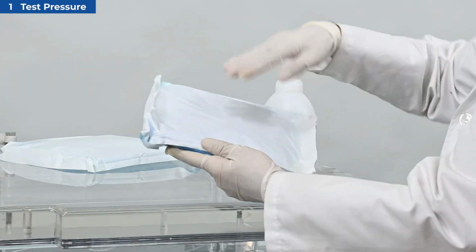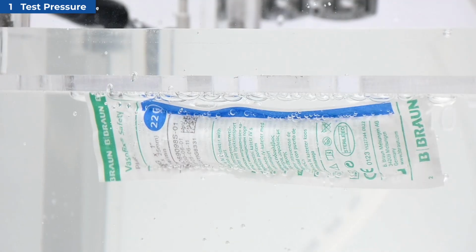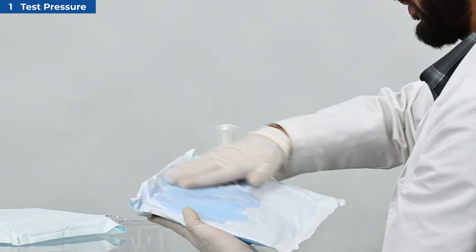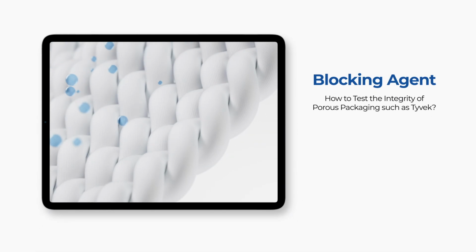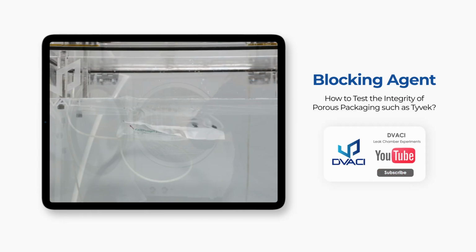In porous packages, such as those made with Tyvek, the natural breathability of the material may generate bubbles that do not correspond to a leak. ASTM F2096 acknowledges this phenomenon and recommends the use of a blocking agent. We have a dedicated video showing how to apply it correctly. If you work with Tyvek or medical paper, we strongly recommend reviewing it to avoid false readings and to define reliable parameters.